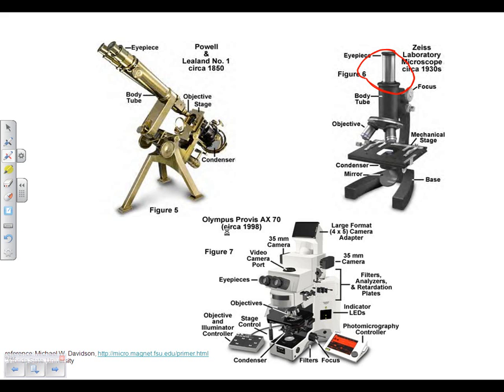This microscope down here, though this is now a few years old picture-wise, is pretty much what a real research microscope looks like, and it'll cost you upwards of $40,000 or $50,000 or more, because it has all kinds of interesting optics, probably does fluorescence, and has an embedded camera with all kinds of controllers. But that's sort of the state-of-the-art kind of research microscope, and they go up from there. So let's just give you a little historical perspective to see how we've gotten to the point where you guys can have a student microscope that's way better than any of those ones that came before.